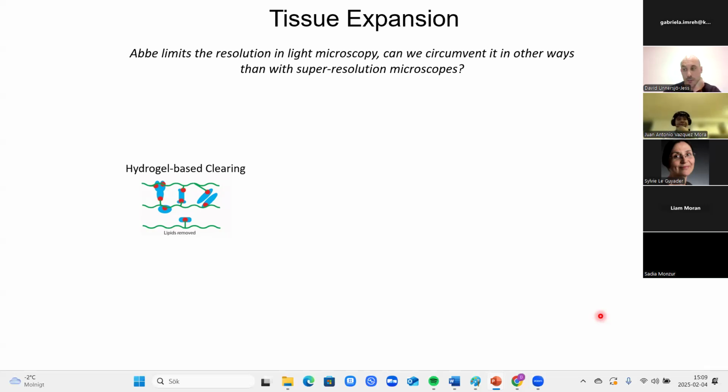But then it really depends. If you have a very highly expressed protein that you're staining for, you might have to go even higher, because you have so much protein that it will just consume your antibody right away. Okay, great. Thanks.